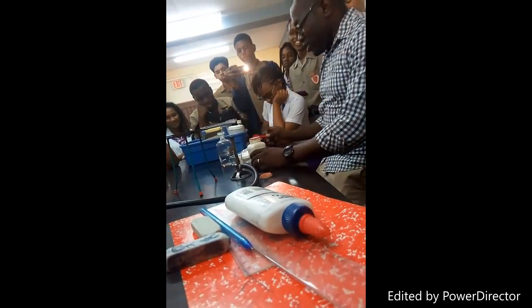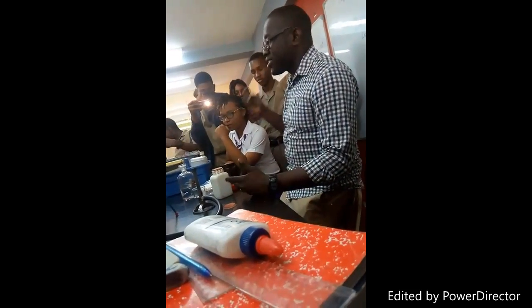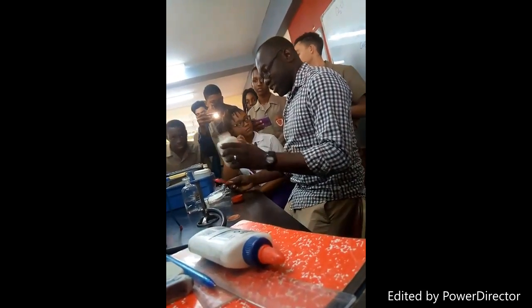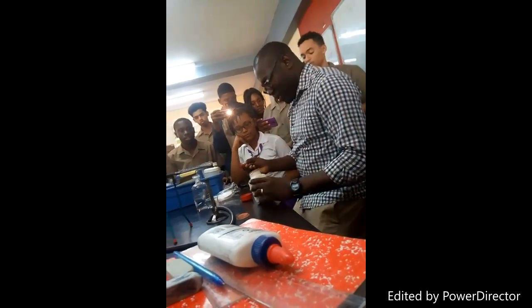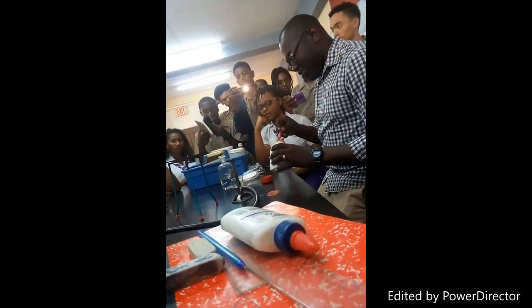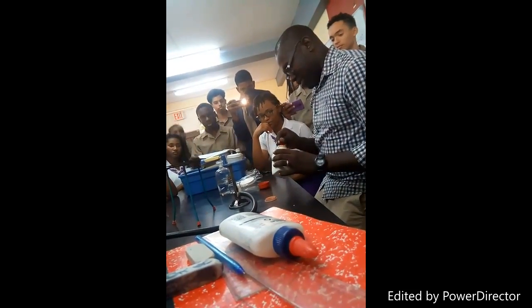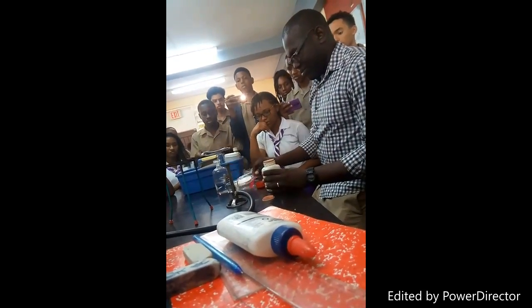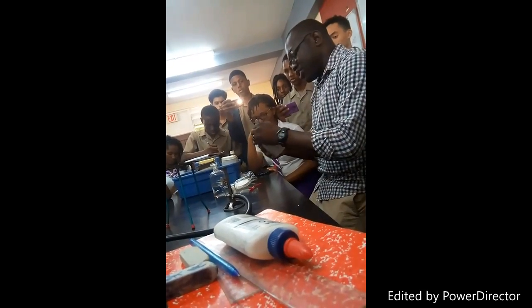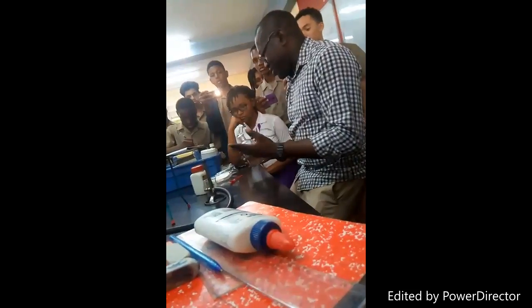Alright, so we're going to react based on the concept map. If you want to make a soluble salt, which copper sulfate is, I'm just telling you that, you use direct combination. So we're going to react this oxide, which is red in color, with sulfuric acid. And what type of reaction is this? Neutralization.